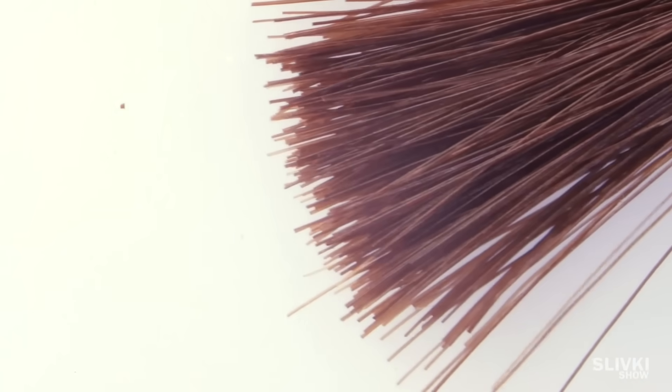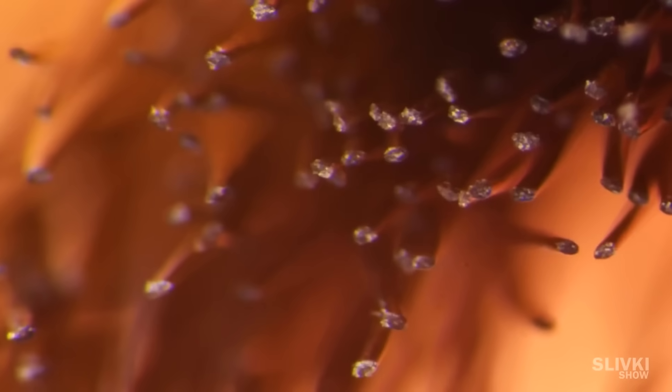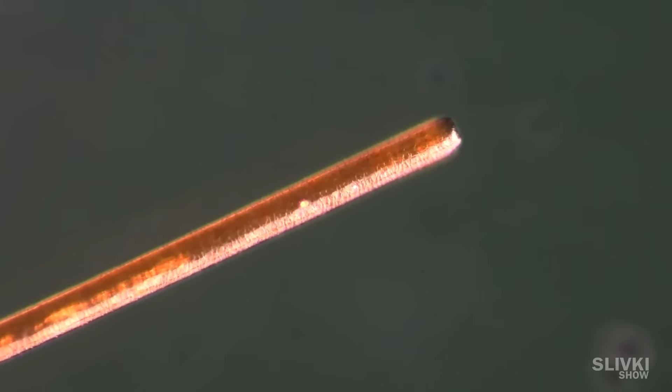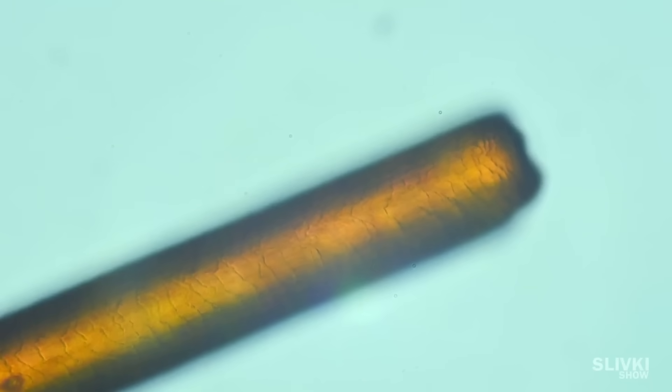Let's look at a person's hair. With a little bit of magnification it looks like some kind of black macaroni — here's the end cut off by scissors. Remember the shampoo commercials where they show the scaly surface structure of hair? Now we can actually see those scales.